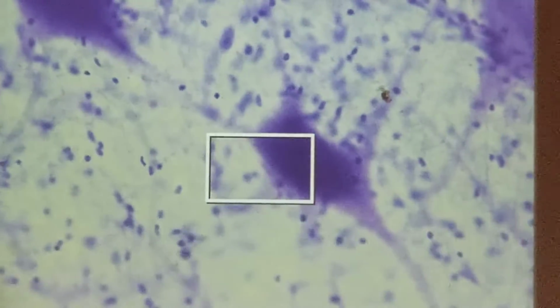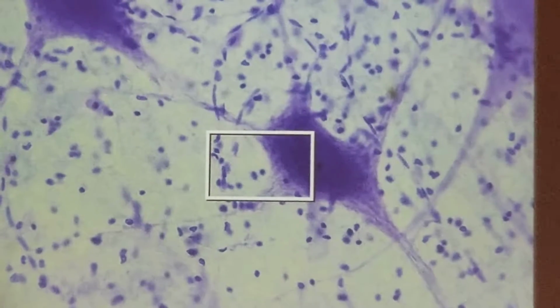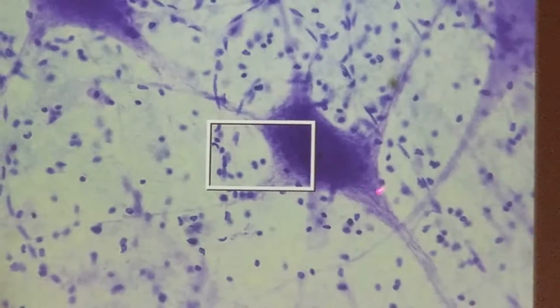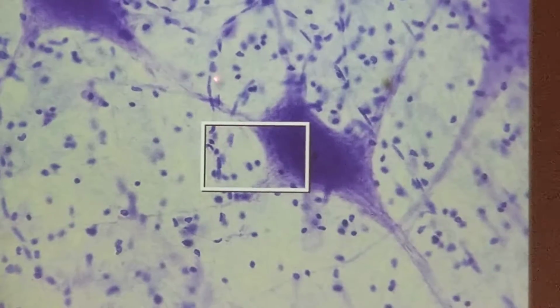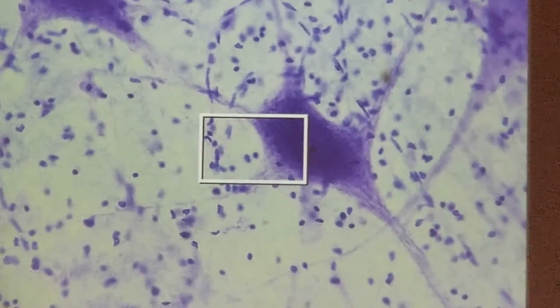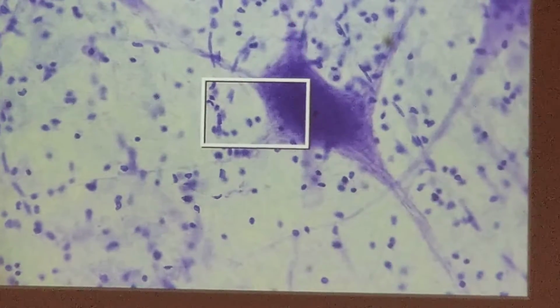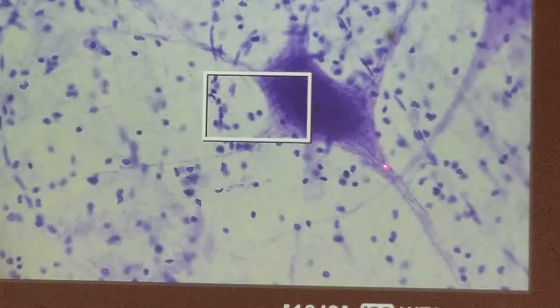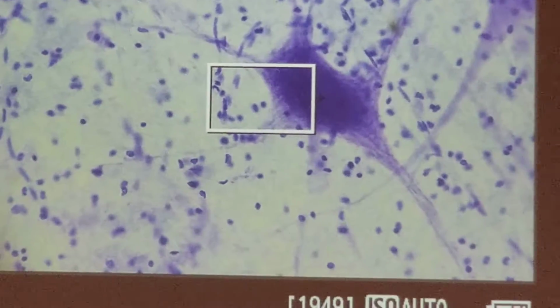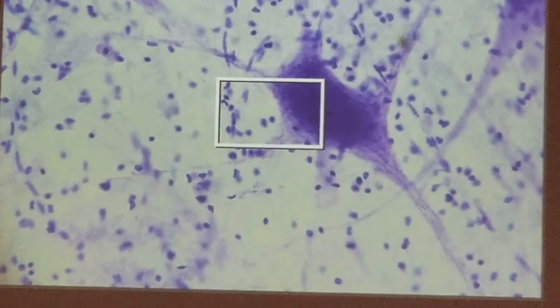Again, with this, because we're going to look at these when we do nervous tissue, I just want you to be able to notice that this is nerve tissue. So there's the cell body right there. And where it says axon, put a slash, and next to that put dendrite. All these limbs coming off here, here, here, and here, they're either axons or dendrites, and I'm not going to ask you to distinguish between them right now. We'll do that when we do nervous tissue, okay?